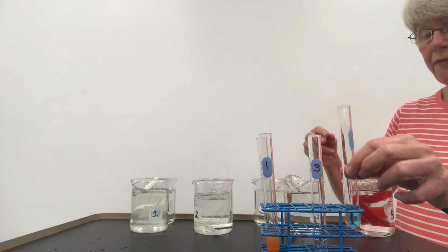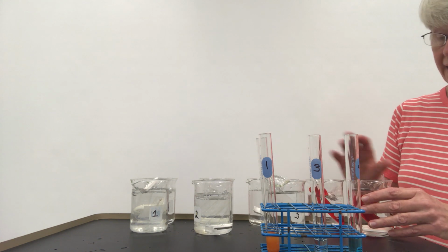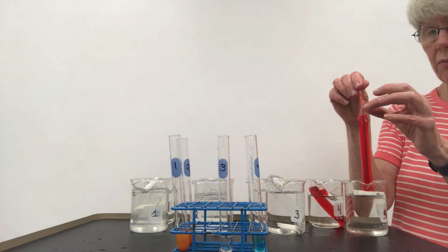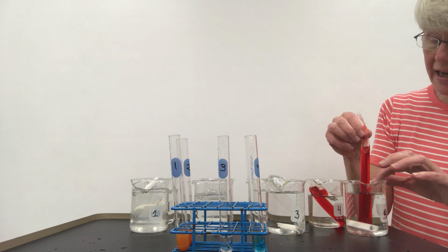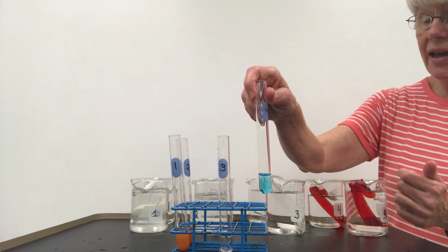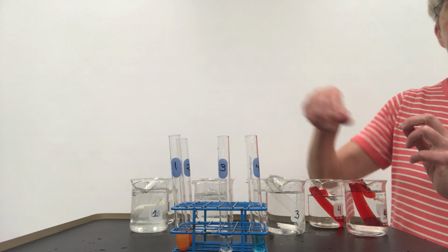Okay. And then for test 4, we have sucrose in our sac. We're going to test for the presence of sucrose outside the sac. The negative part of this is, though, remember, sucrose is a disaccharide. It's considerably larger. So when we test for the presence of sugar in the solution, we end up with a negative test. The negative test, that is still blue, of Benedict's indicates that no sugar was able to move out.